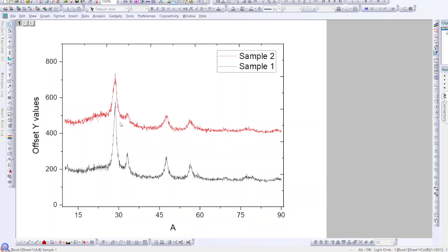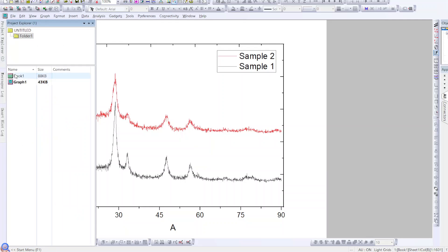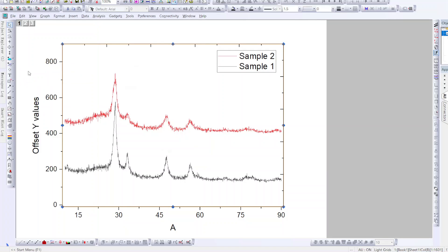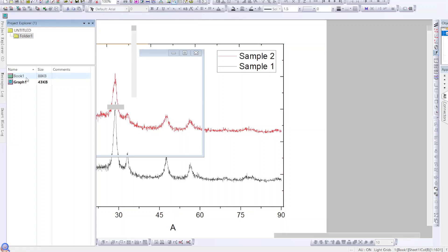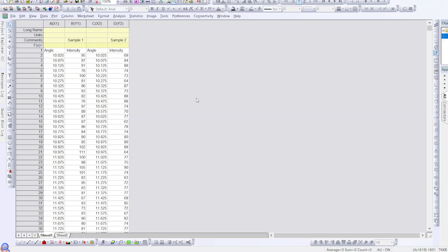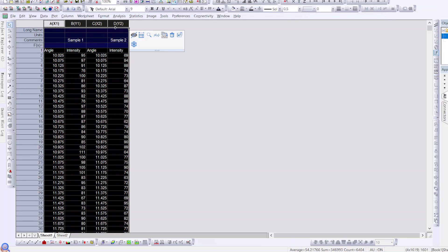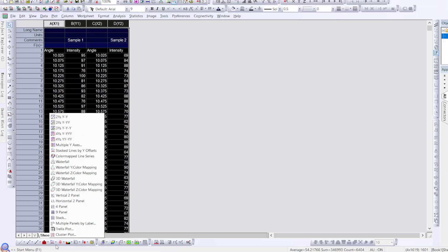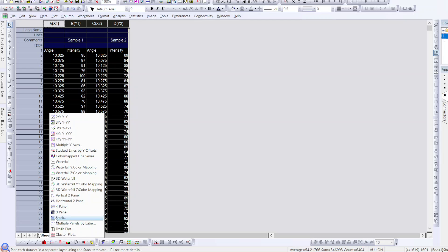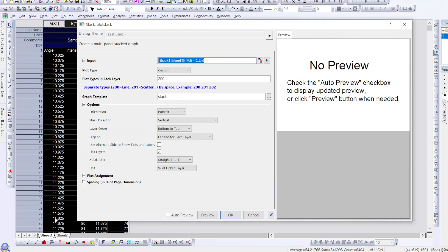That was the first way to plot your XRD data. For the second method, go back to your data by clicking here. Select all the data again, go to the same drop-down option, but this time choose Stack. A window will appear — simply click OK.